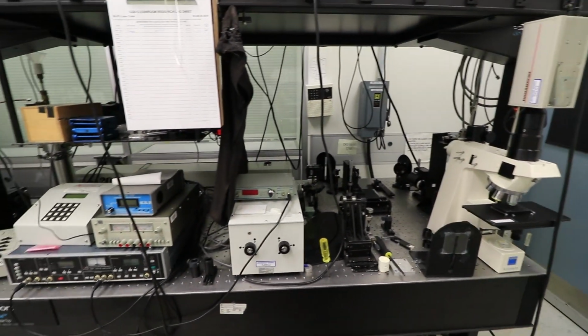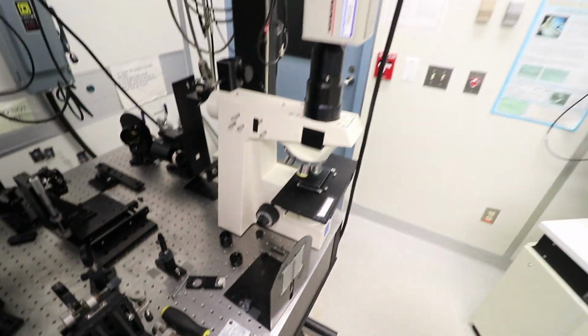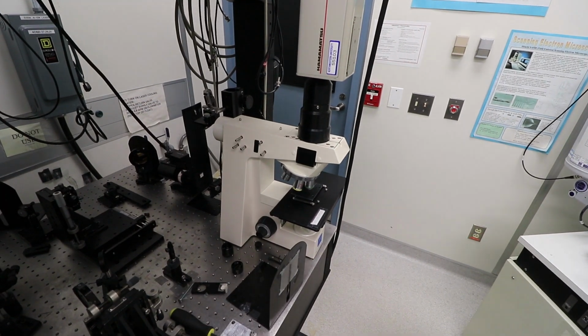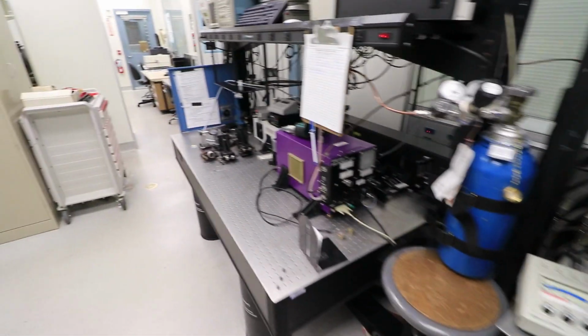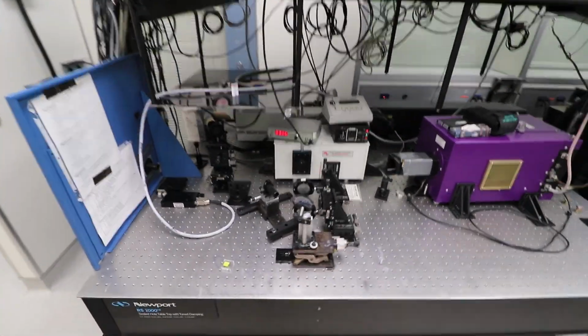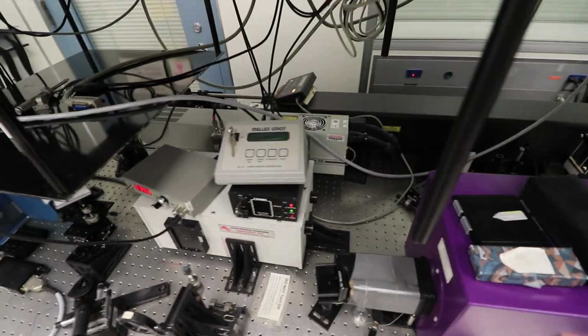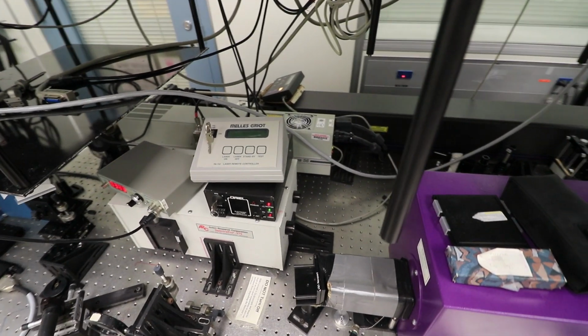Equipment for optical characterization includes an infrared photoluminescence system using a green argon ion laser. The signal can either be collected with a monochromator or with a microscope and camera to measure the topographical photoluminescence. In the ultraviolet, photoluminescence is done using either an argon fluoride excimer laser at 193 nanometers, a frequency doubled continuous wave argon ion laser emitting at 244 nanometers, or a continuous wave helium cadmium laser at 325 nanometers.